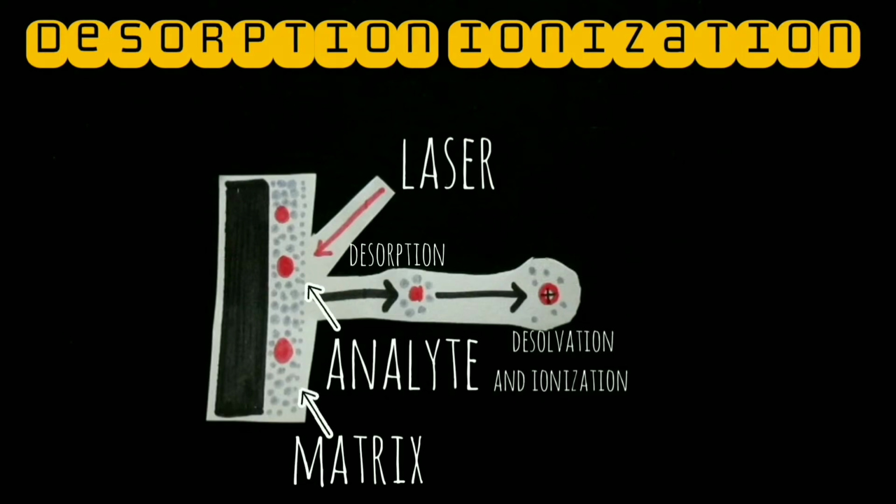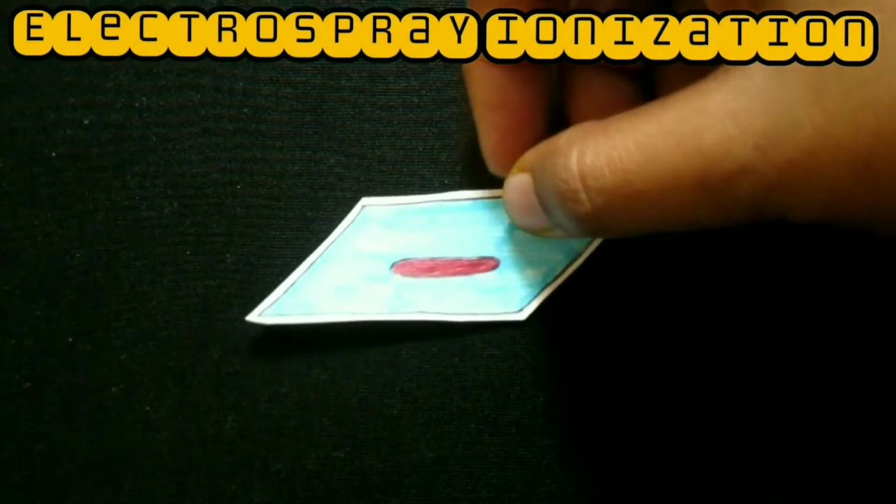Now we are introduced to electrospray ionization.